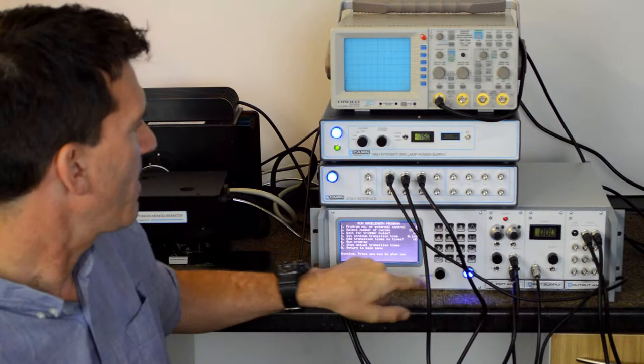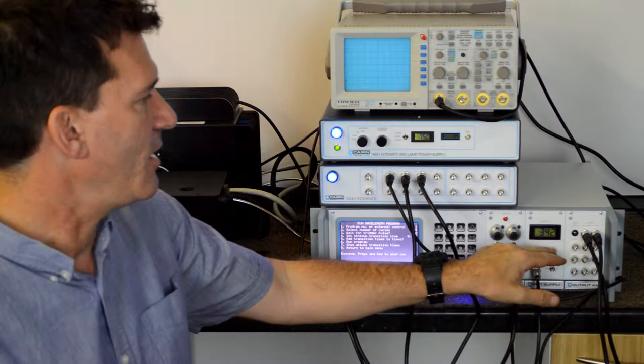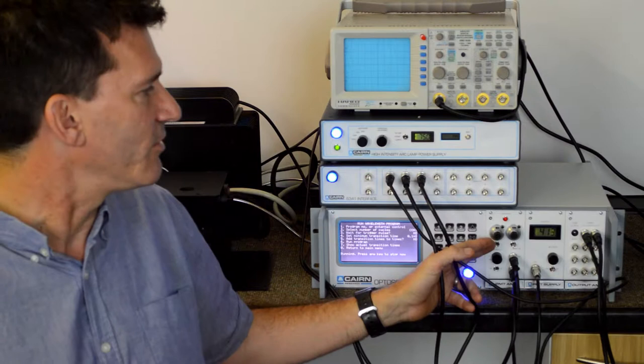So having done that, I run the protocol with the photomultiplier voltage turned down and the amplifier gain high. I edge up the photomultiplier gain and you can see that the traces are starting to get to quite a number of volts.